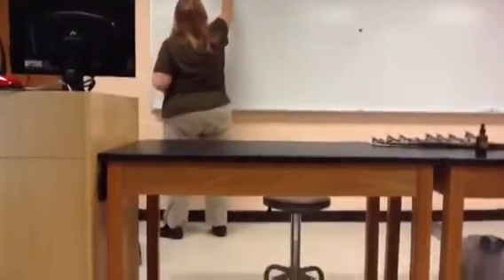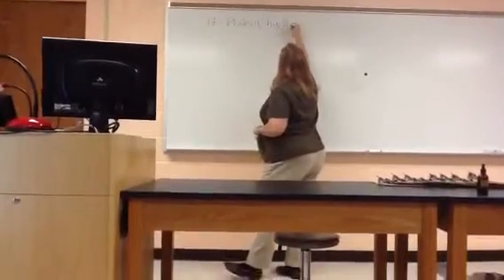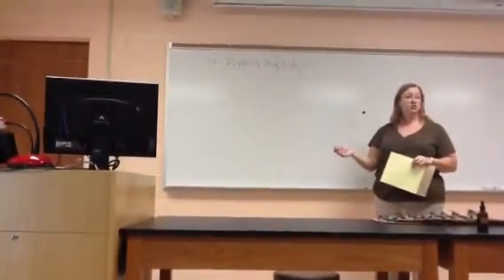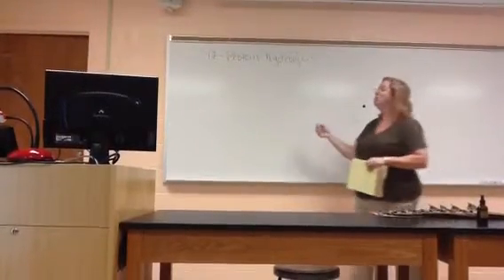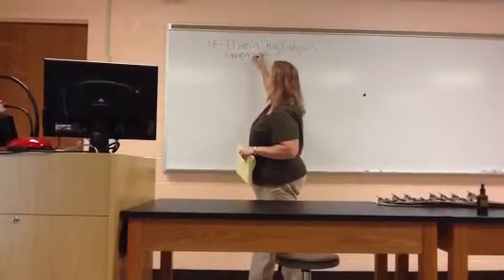This is Lab 17. So we're still doing hydrolysis here, right? They add water to break bonds, and this time the large molecule we're testing is protein, to see if they can break it down. It's still done externally because they're not big enough to eat a whole piece of protein and digest it inside, so it's external, which means there's going to be an exoenzyme released.